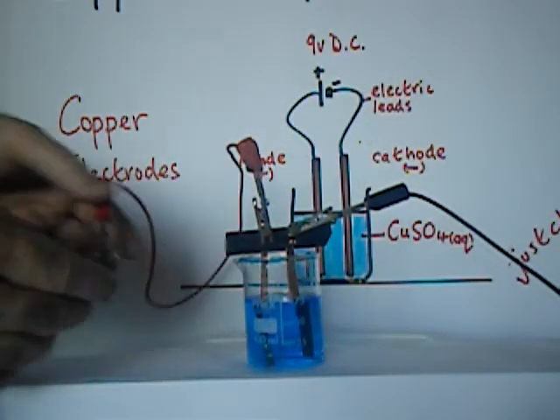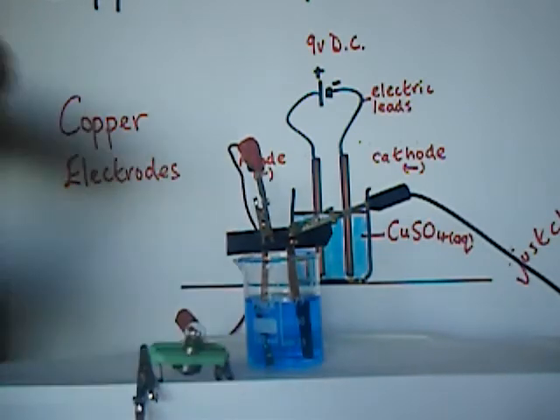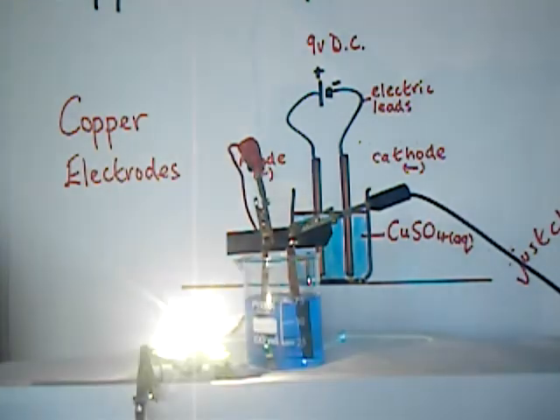I've got a bulb in the circuit here as well, so we can see if the current is actually flowing. And I'm going to switch the power pack on now. You can see the solution's an excellent conductor. The bulb lights up immediately.